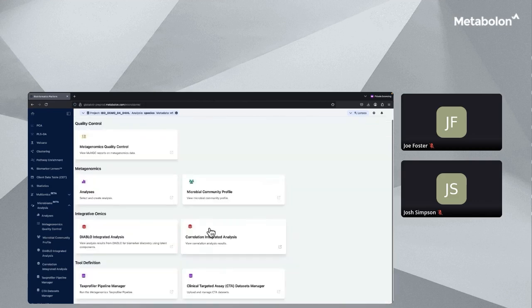Those were our metagenomic analyses, so now let's integrate that data with metabolomics data to explore the functional consequences of those microbial shifts. So DIABLO is a supervised multi-omics integration method that identifies the biological features, in our case the microbial taxa and the metabolites, that are co-associated with different study groups, and it can be used to uncover the combinations of variables that actually best separate the groups, in our case, IBD versus non-IBD. In other words, DIABLO helps us develop models that link microbes and metabolites to our study groups, which can then help highlight the key drivers of host phenotypes.